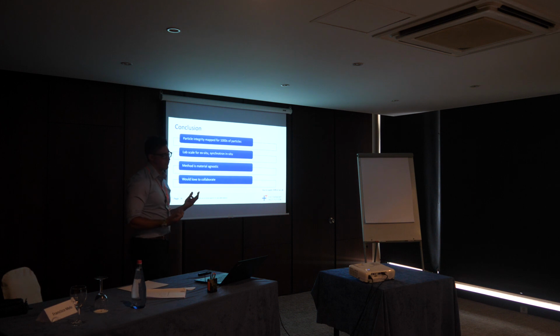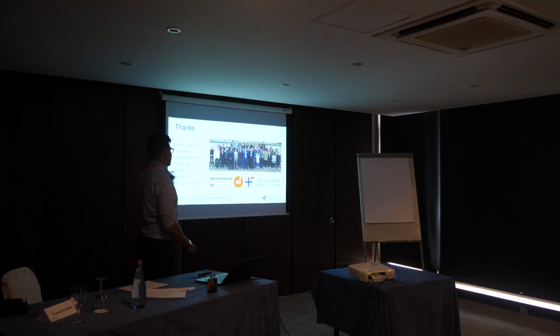But we've mapped the integrity of thousands of particles internally. We've done both lab scale and synchrotron work, for ex situ and in situ. Hopefully this method is material agnostic, so one of my reasons to come here is I want to work with people who know a lot more about fracture than I do. I'm a battery or X-ray guy looking at fracture. Hopefully some of you are fracture people who want to apply what you know to battery materials, or we can apply this method to your materials to quantify how bad the damage is. So we'd love to collaborate, and thanks to lots of different people in my group who helped out with this work.